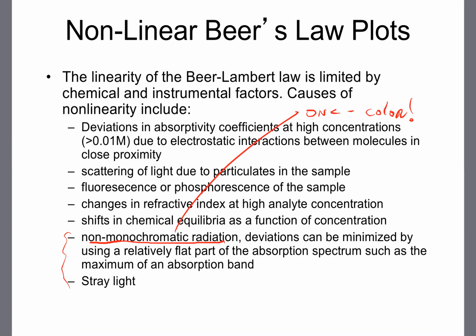But all the other wavelengths which are not absorbed will simply pass through the sample and hit the detector, producing an electrical signal. So once the wavelengths that are absorbed are gone, there will be no further change in absorbance noted in such samples because the other light just passes through unaffected. So because of this, you really always want to use monochromatic radiation when you're doing these measurements, light of one color or narrow bandwidth, okay?